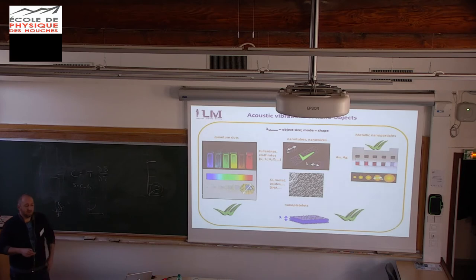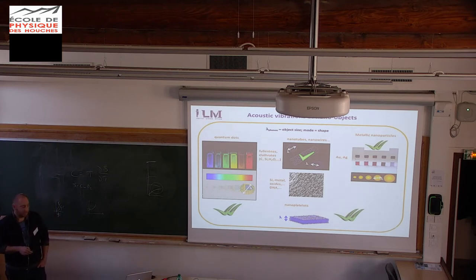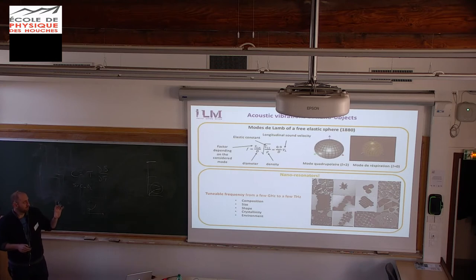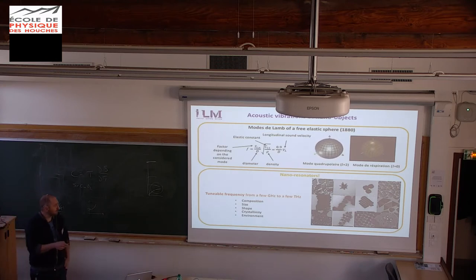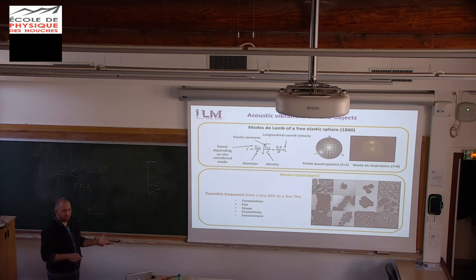And if you look at the literature, I think low frequency Raman scattering is used for many, many types of nano-objects, from quantum dots, carbon nanotubes, fullerenes, DNA to oxide, well, many things. And in this talk, I will really talk about these metallic nanoparticles, this kind of nanoplatelets. And I will show you some examples. So what I want to attract your attention to is the fact that these nanoparticles are really simple nanoresonators. Their frequency can be driven by their composition, size, shape, crystallinity and environment.